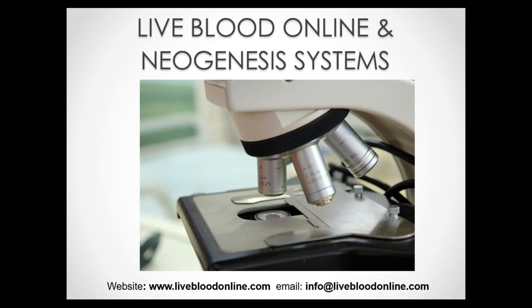Now, also in terms of clinical studies, it's very difficult to put together a clinical study for live blood analysis because many of the conditions that we're able to detect with live blood analysis cannot be detected or verified by conventionally accepted tests to the same degree of accuracy and sensitivity as live blood analysis. So that's one of the main reasons why there's only a small amount of research on live blood analysis, specifically clinical type of research or scientific studies.